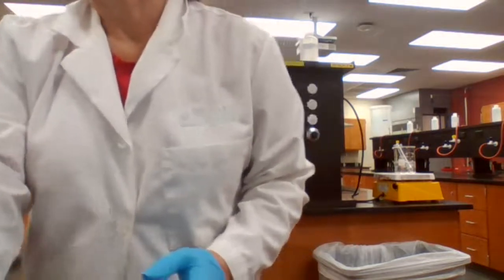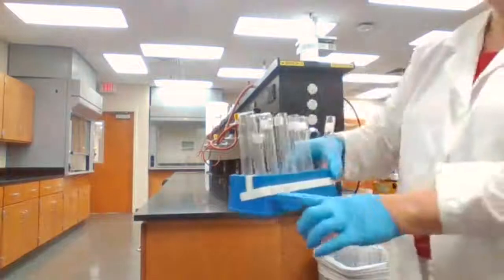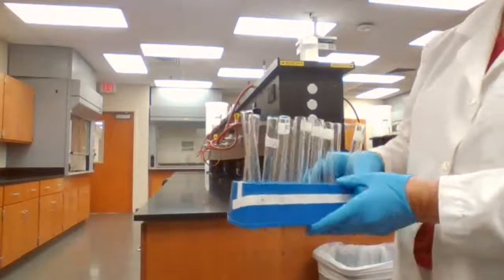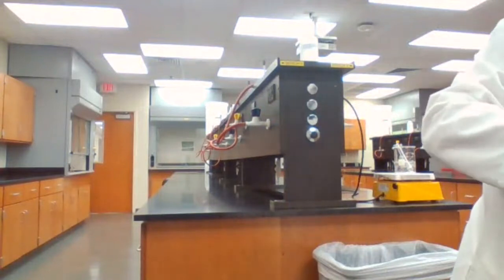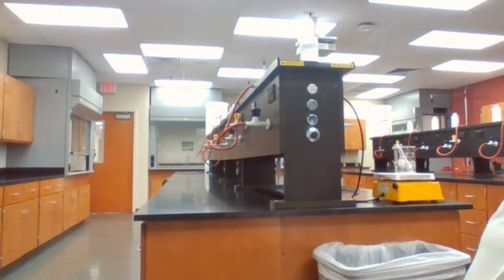Okay. I'm going to take 4 test tubes, and they are labeled A, B, C, and D. I'm going to take the rest of the test tubes out, so I know I'm working with 4 test tubes at a time.